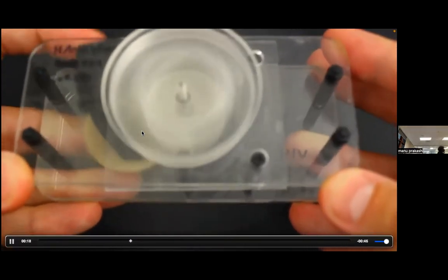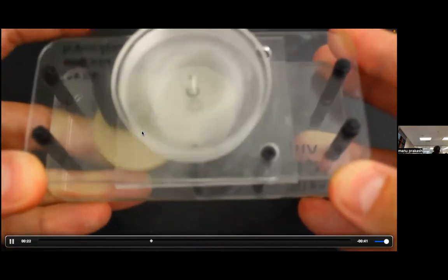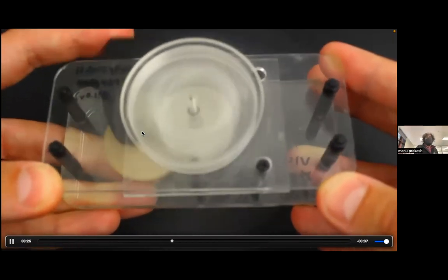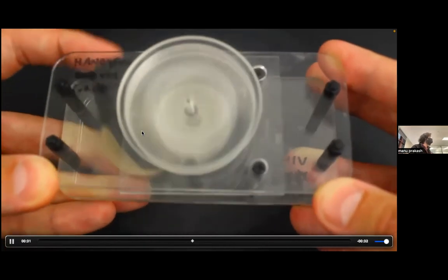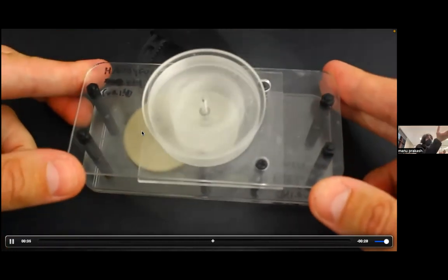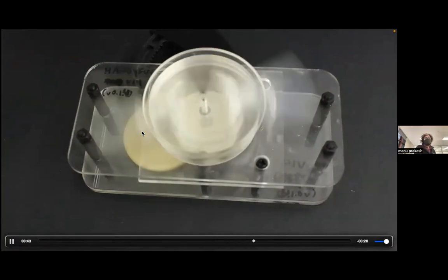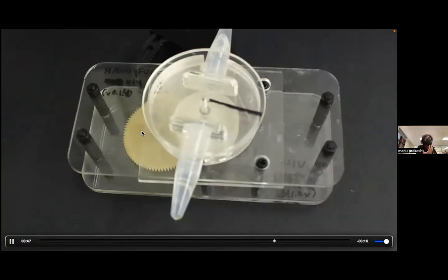There we would be around 10, I would say 20 microliters, which is a drop of blood. This is much, much larger volume. And this is a key step in an extraction for RNA and DNA. So we've also been using this in an eDNA context. When you go out in the field, you just want to collect the DNA and not collect a massive amount of sample that you bring back. So this is another very important step for doing extractions.